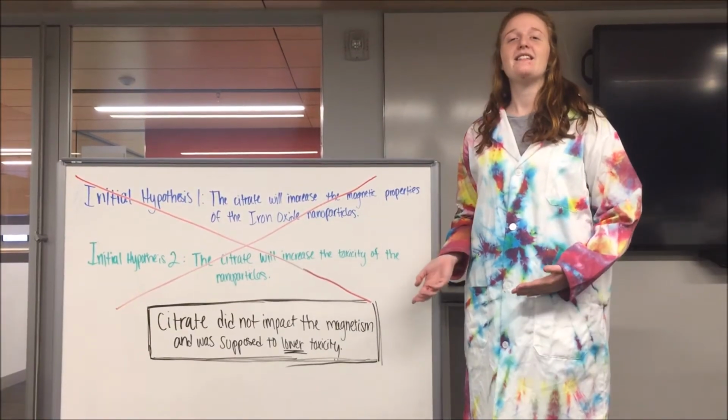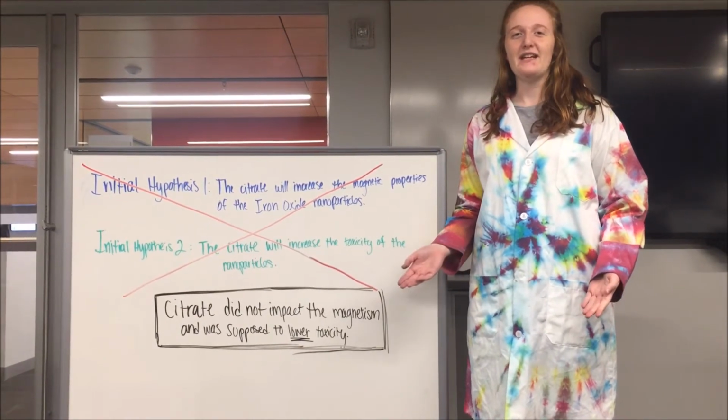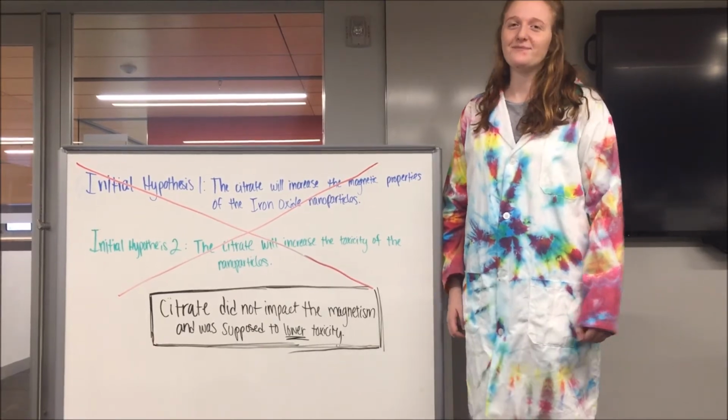In the end, the citrate actually did not affect the magnetism properties of the nanoparticles, and it actually decreased the toxicity of the nanoparticles as well.